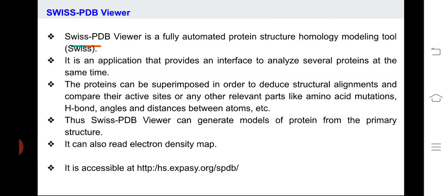These functions can be seen in Swiss PDB viewer. It is an application that provides an interface to analyze several proteins at the same time. When comparing candidate protein structures or other color structures, the best one will be chosen.